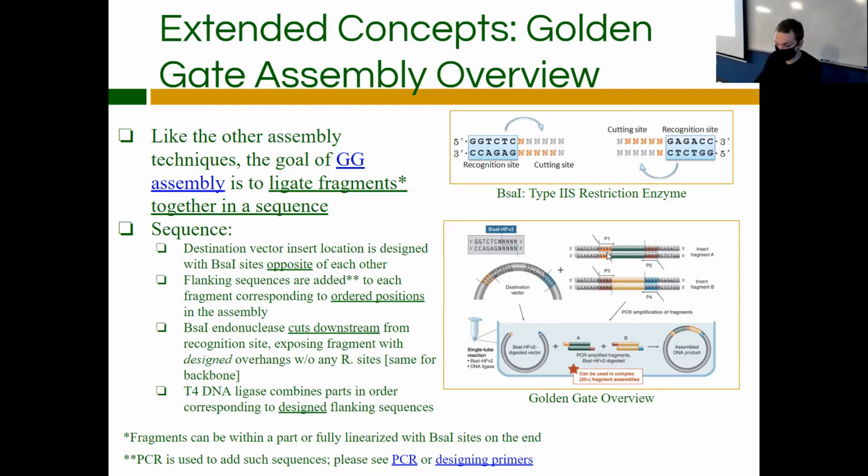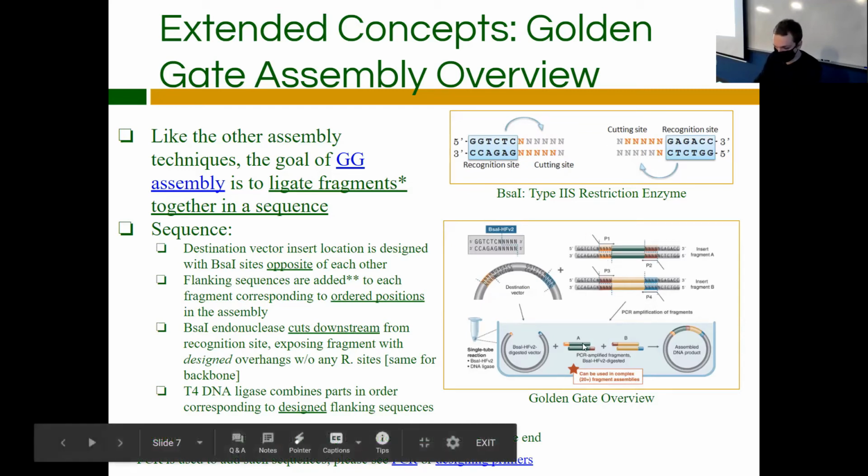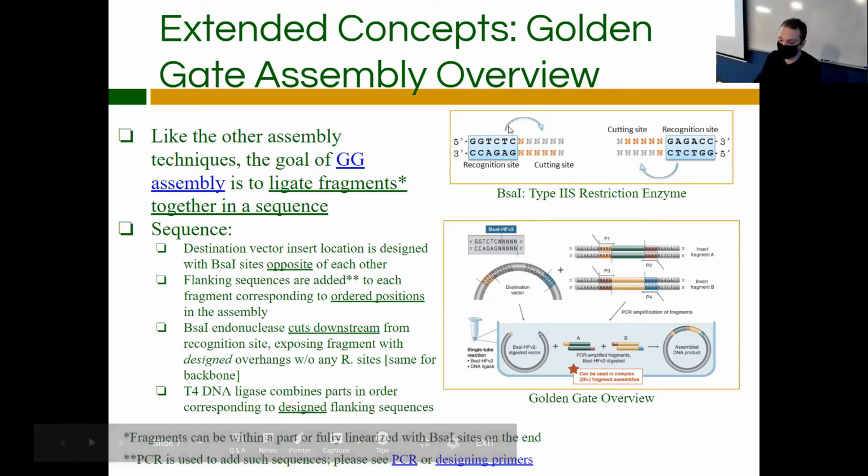You ligate the parts together like here. And then your restriction enzyme site's just gone, right? You don't have to use it.